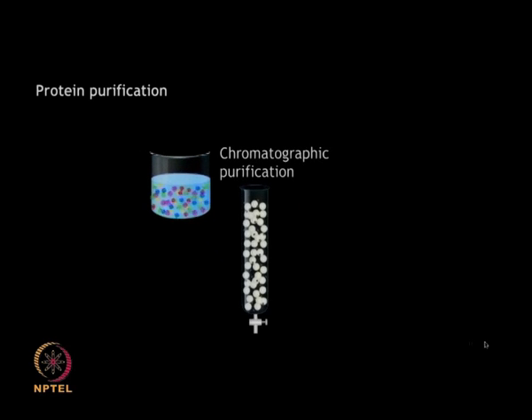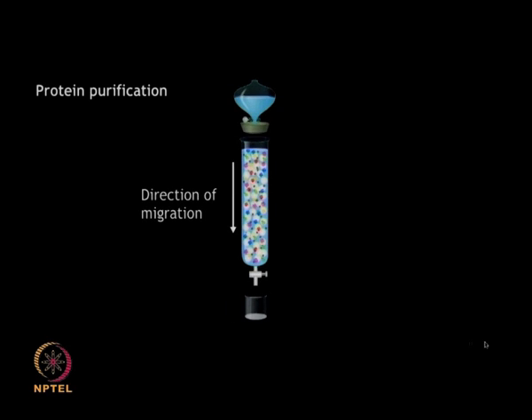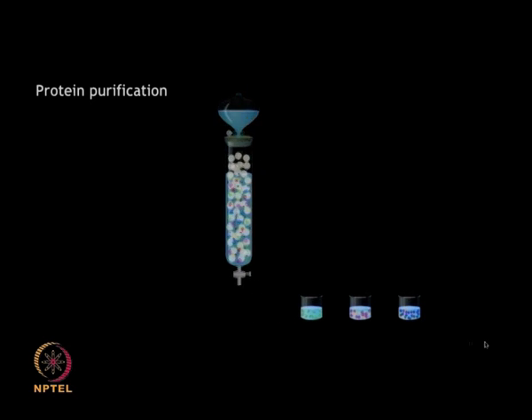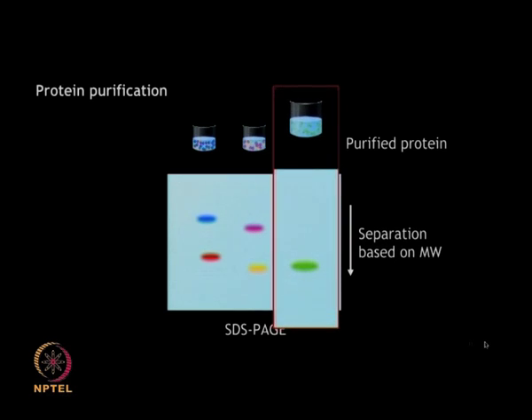This can be achieved by using chromatography procedures to obtain pure target proteins. The unwanted proteins are first eluted out, and then the specific proteins can be purified and eluted. The protein purity can be tested on SDS-PAGE gels. Tags like histidine 6 are often fused with the protein of interest.